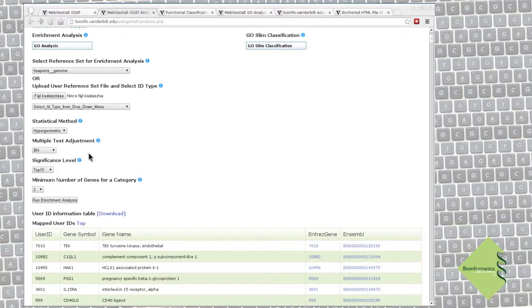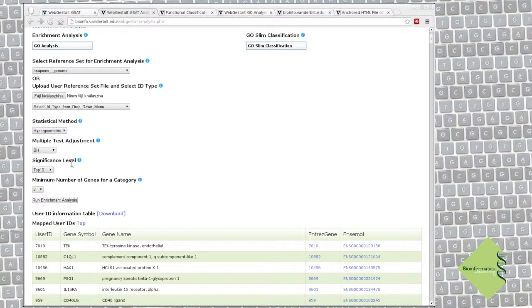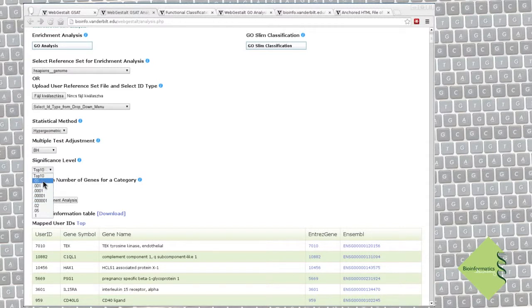In a first-time analysis, we always want to see the best 10 categories, so we have a good overview about the general significance of the enriched terms. Later on, we can set an exact threshold if there are too many strongly significant terms among the results.